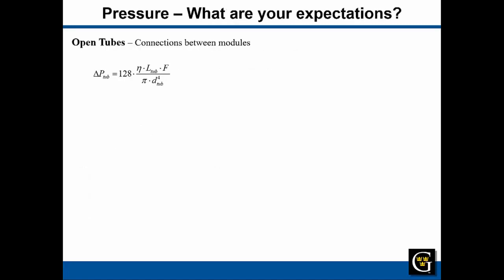And so this is the first place where we can talk about expectations. The only way we can know if the pressure we're seeing is too high or too low is to have an expectation about what we should see, something to compare our observation against.